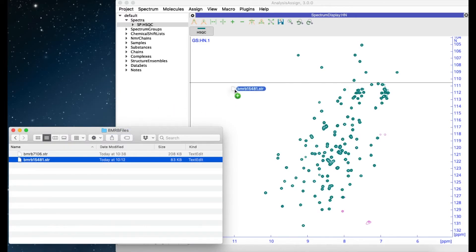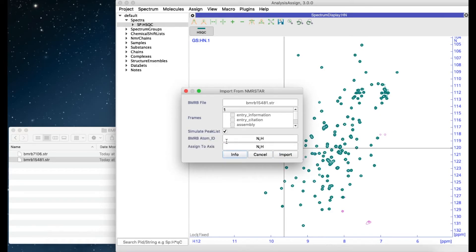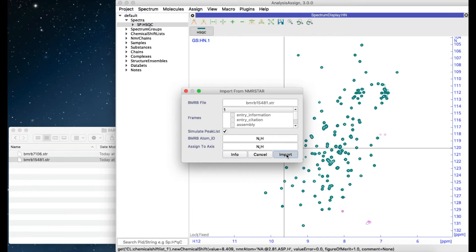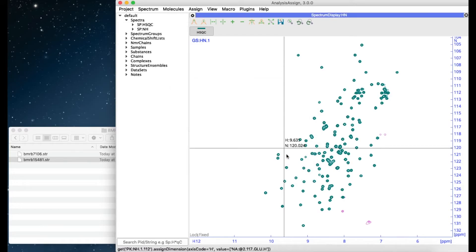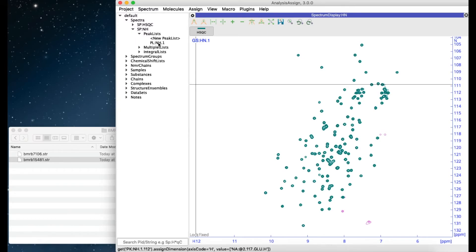Select your file, drag it in, and select Simulate Peak List. Simply type NH and N,H in both these fields and click Import. Once the import is done you will see that a new dummy spectrum is created, simply called NH. This now has the new peak list with the chemical shifts from the BMRB in it.